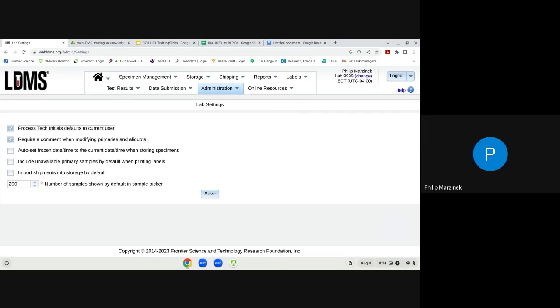The Auto Frozen Set Date/Time feature, when turned on, assigns the current date and time as the frozen date when specimens are stored, indicating when they physically went into storage. When turned off, you must manually set the frozen date and time. Any changes made within Lab Settings require clicking Save to implement those changes to your database.